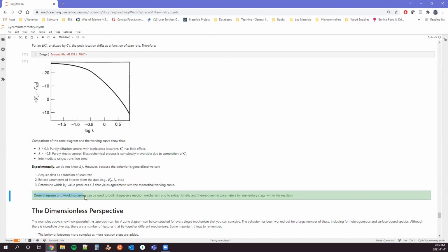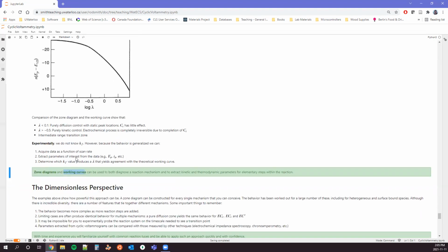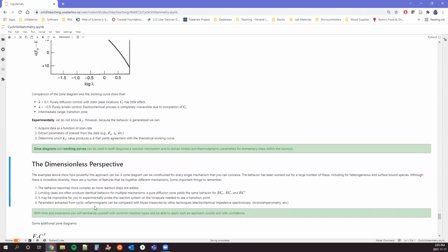And so combining these two together, what we can do is diagnose reaction mechanisms, right? And so we have a different, we'll see in a minute, a different zone diagram, different set of behavior that we expect for different reaction mechanisms. And so matching what we see in a scan rate dependent situation with what we theoretically expect can tell us the order of operations, if you will. These working curves can then be used to pick out specific numbers, thermodynamic values or kinetic values for those interfering chemical reactions.